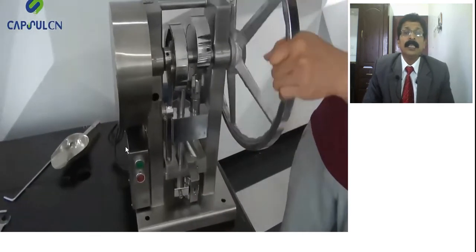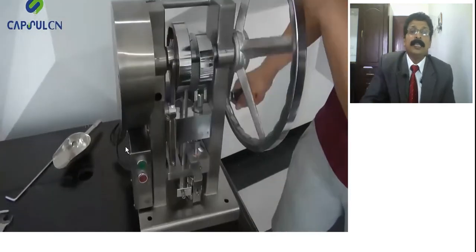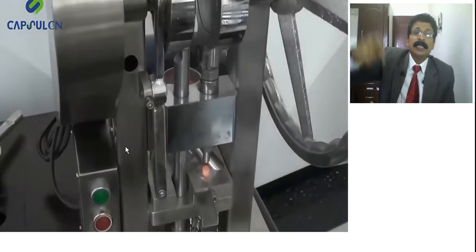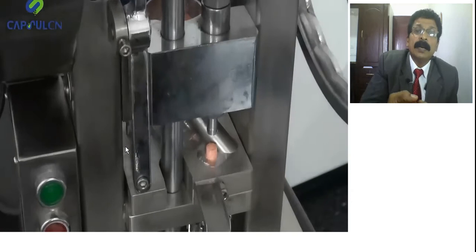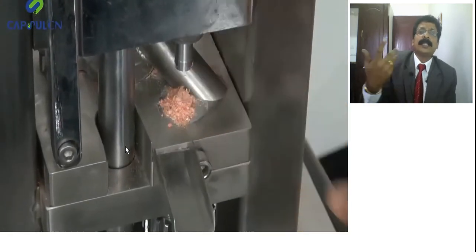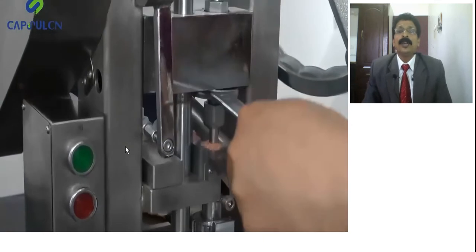By gravitational force, the powder will fill the die. Now, manually by hand, he is pressing it, and it is compressed, and a tablet came out. But the tablet is very soft. When he touches the tablet, it will break. See, it broke. So it is not properly made.